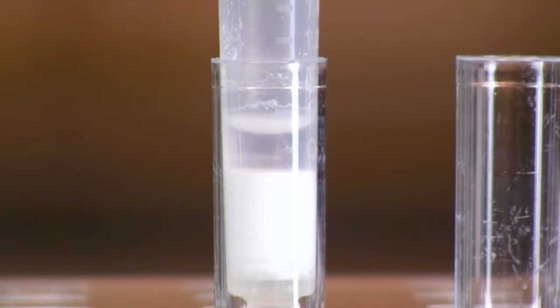When the salt concentration is lowered, the binding of the proteins to the resin is reduced. Highly hydrophobic proteins, such as GFP, elute only in buffer with a very low salt concentration.